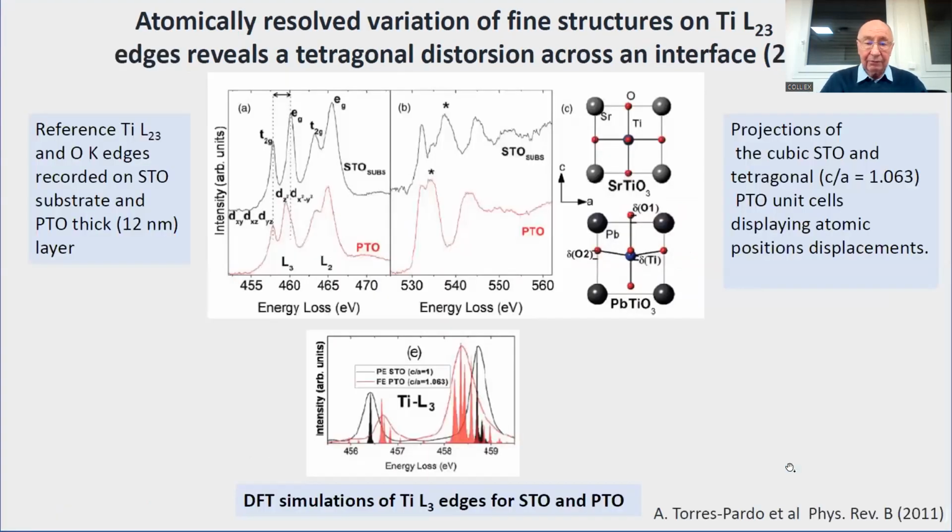Where does it come from? It comes from, after analysis in more detail and calculation with density functional theory, the strontium titanate and the lead titanate. And you see that there is this change of splitting between them.